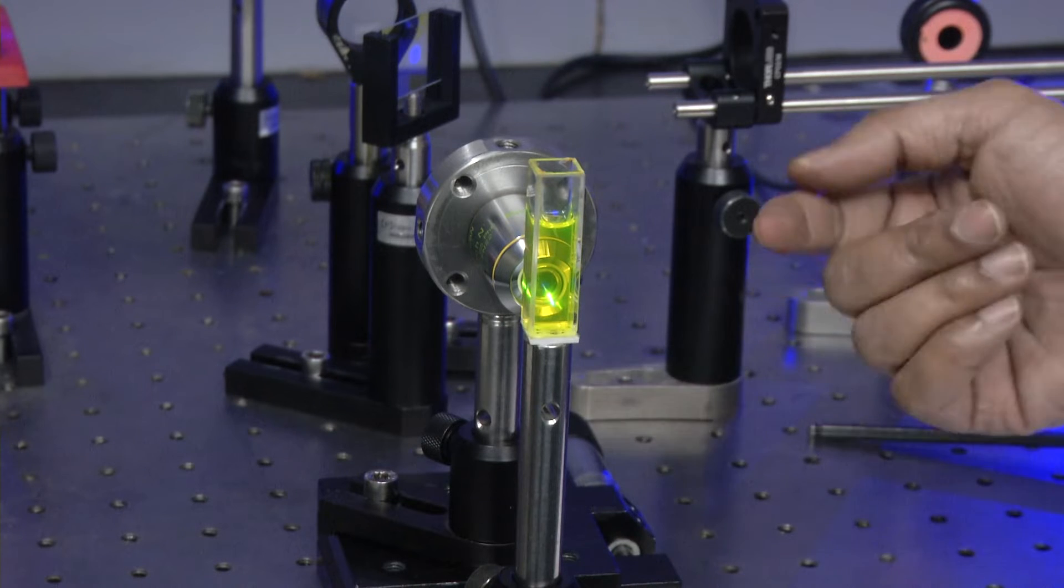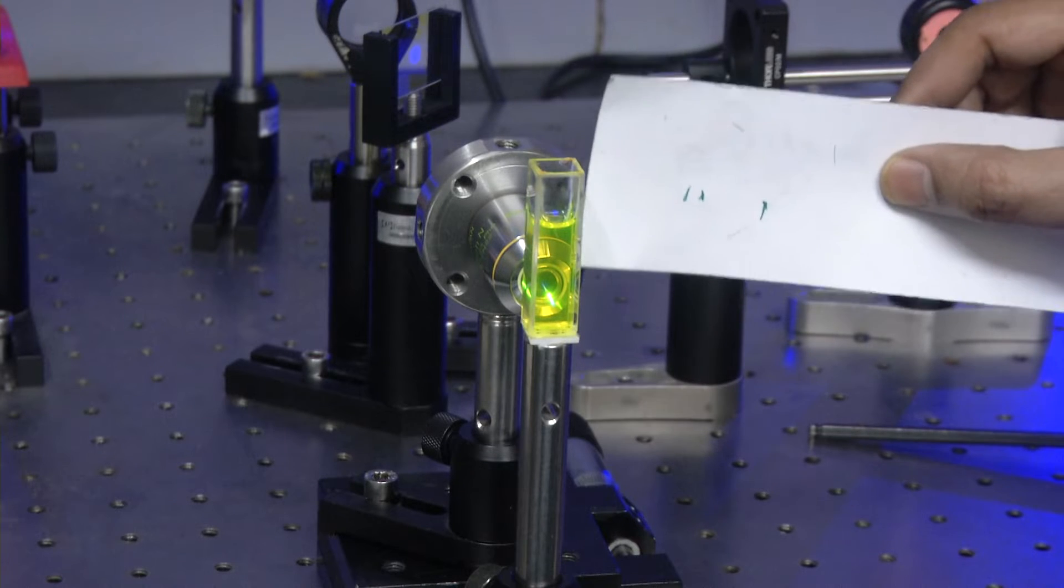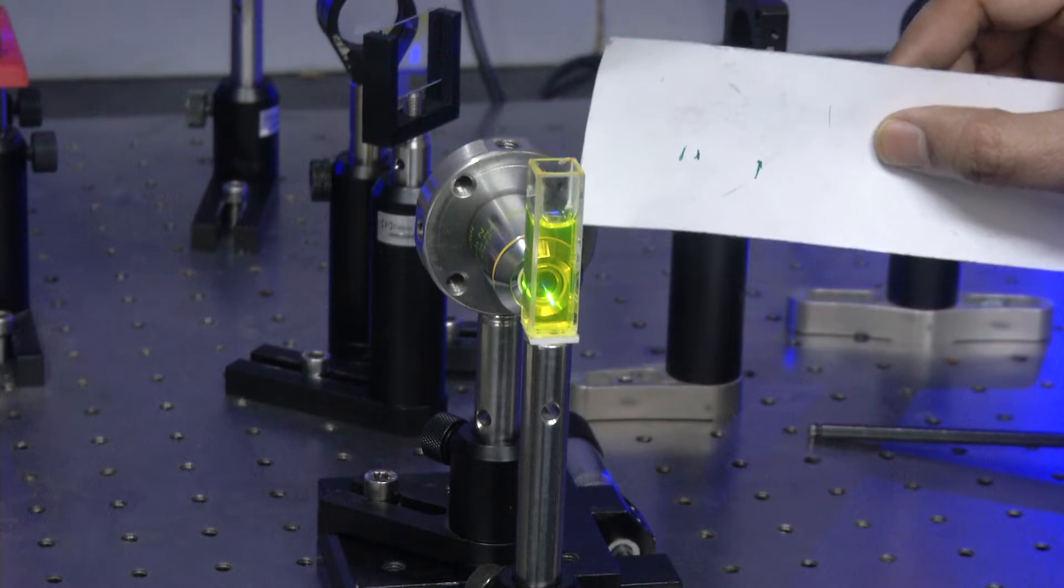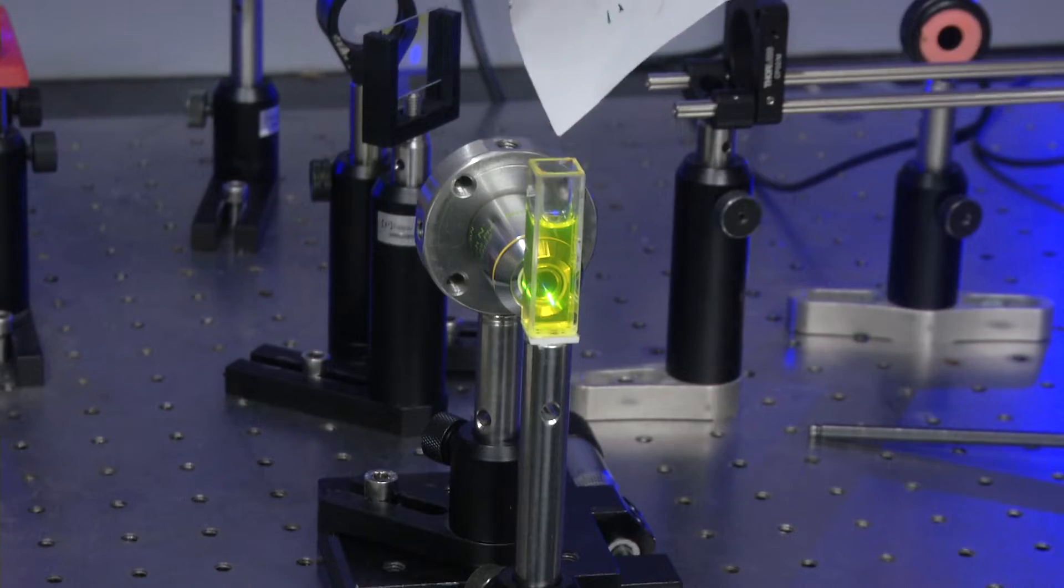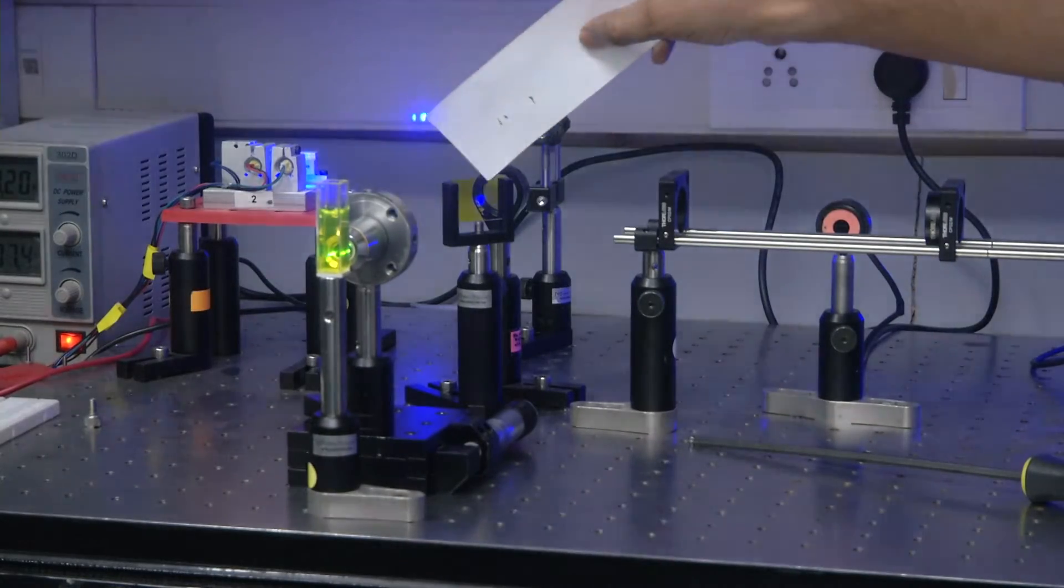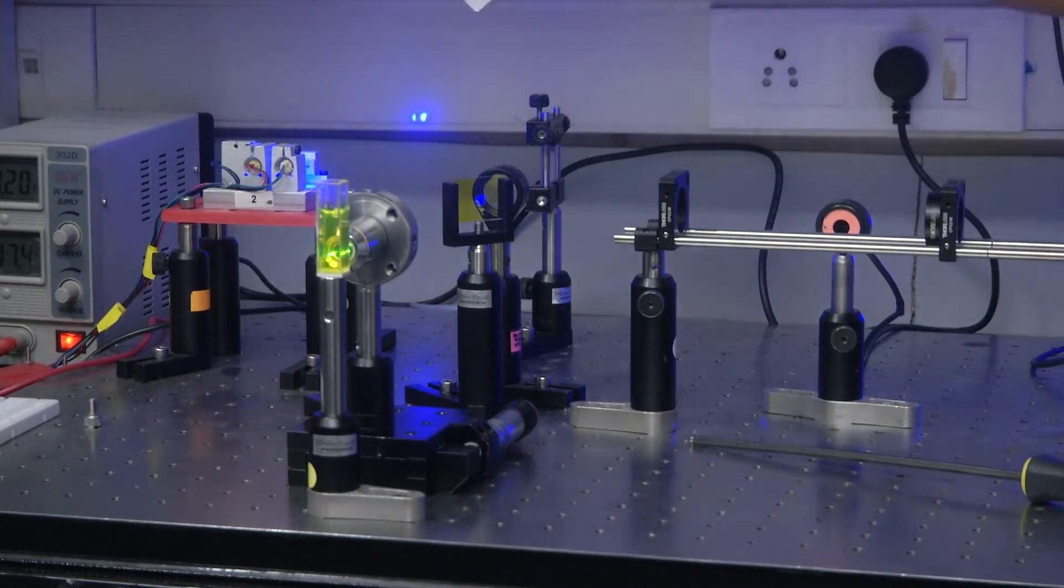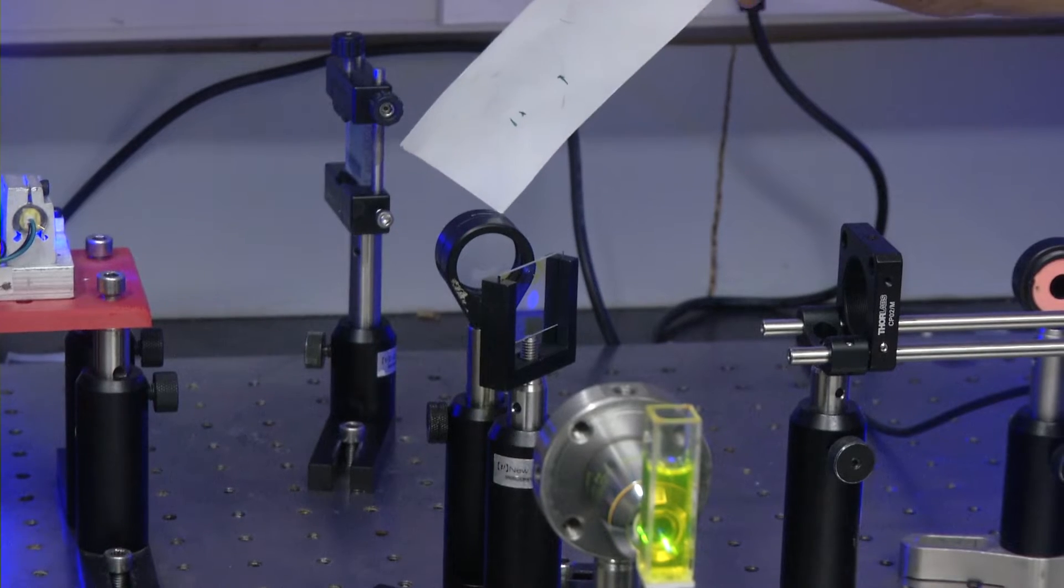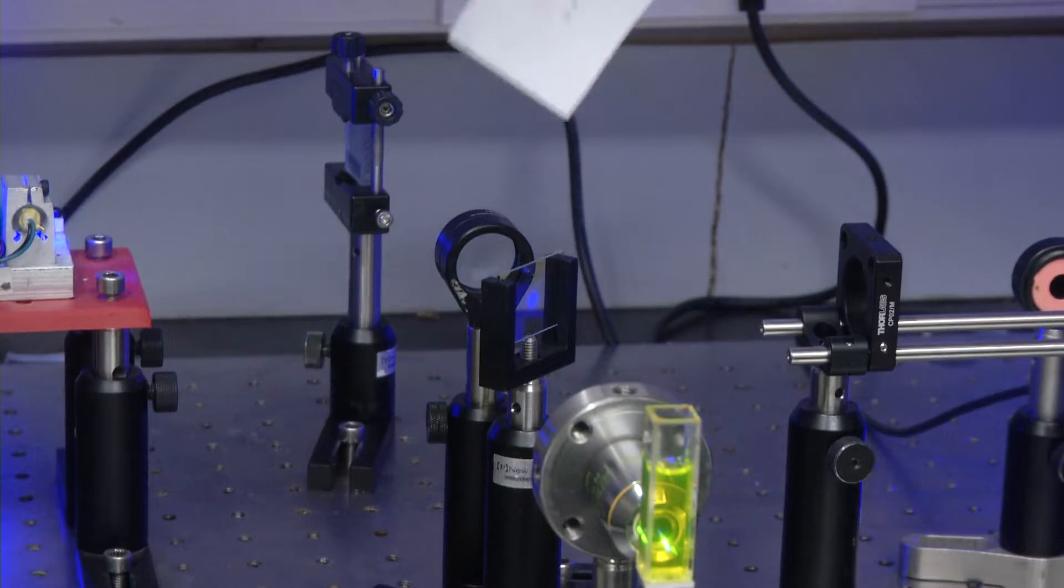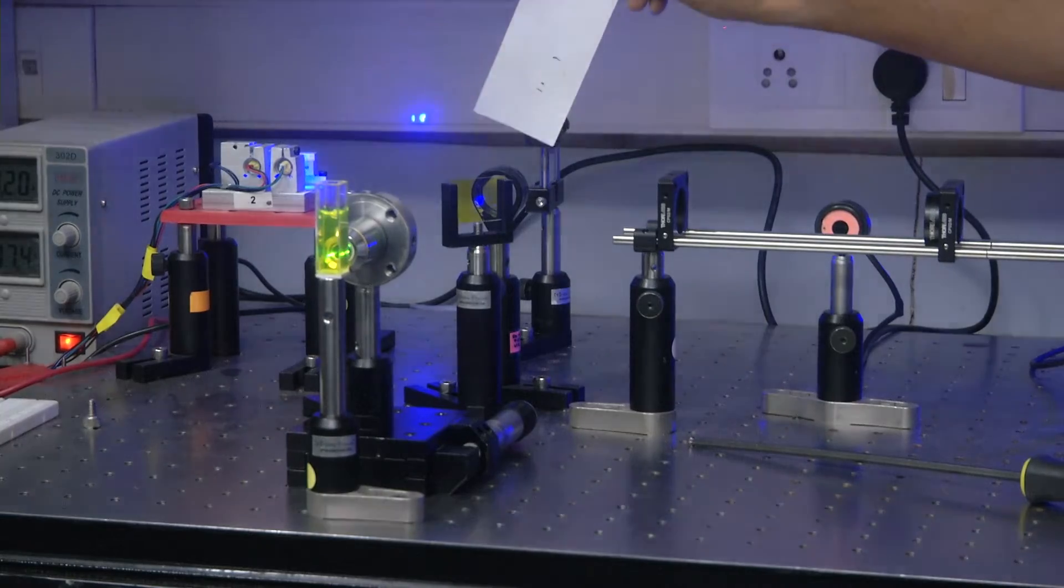What we have created is the fluorescence coming out from the fluorescein solution which is excited by this objective lens. The same objective lens collects back this fluorescence and then becomes collimated, travels through this dichroic. Remember, this dichroic transmits the greenish-yellow light, and it transmits the greenish-yellow light. You have a lens here. This is the same lens that we had in the morning. That lens is about 35 mm.